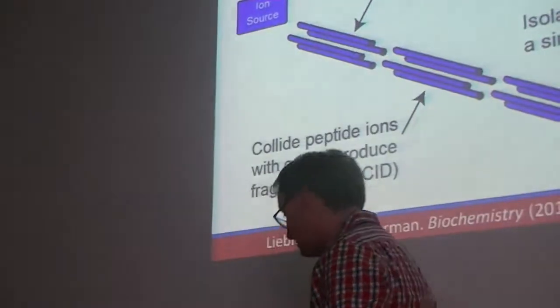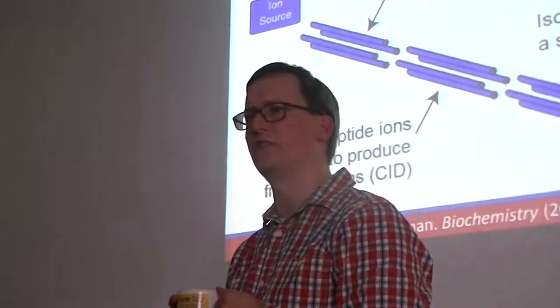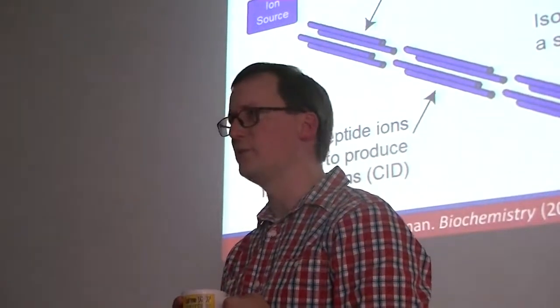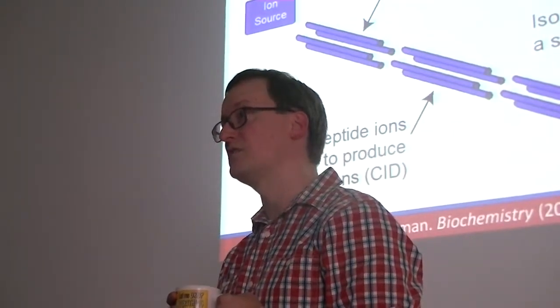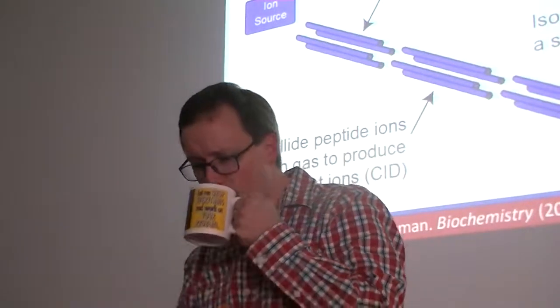This really matters. Now, I've mentioned triple quads a few times. I've mentioned a few kinds of instruments to you: ion traps and QTOFs and Fourier transform instruments, and now the triple quad. But I'm going to emphasize the triple quad in part because this instrument design has been so stable and so important for the last couple decades.